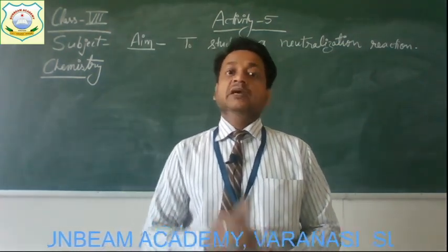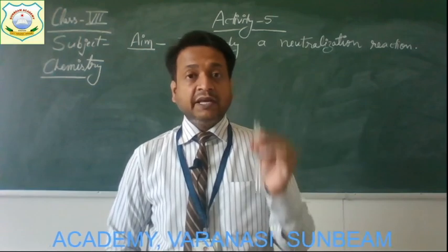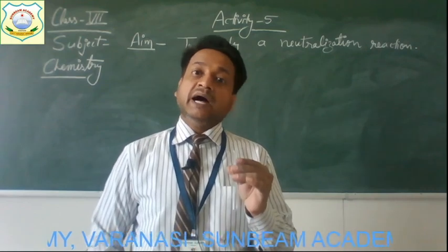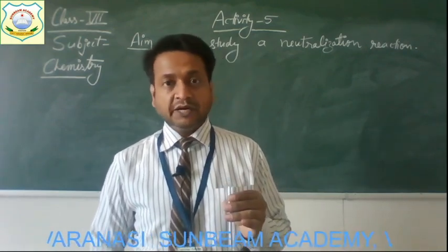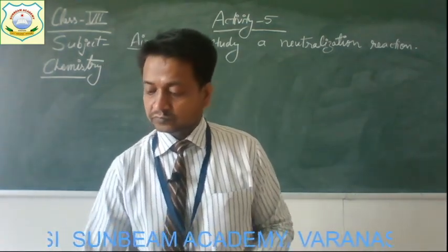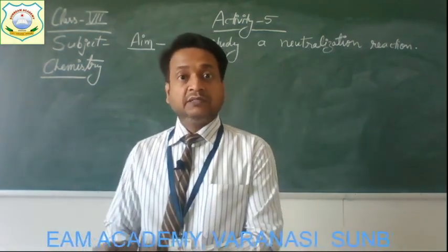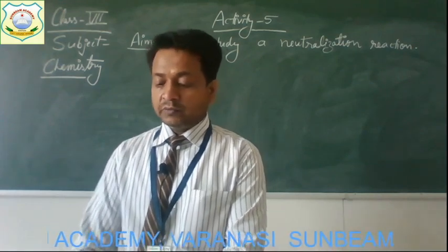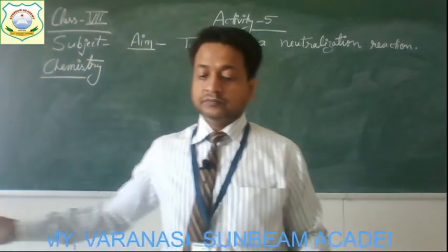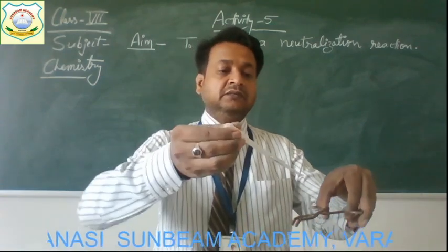Alright children. First of all, in a test tube, we will take some sodium hydroxide solution. We will always hold our test tube with a test tube holder, children. So hold the test tube with the test tube holder, and with the help of a dropper, I am going to put some sodium hydroxide solution in it.